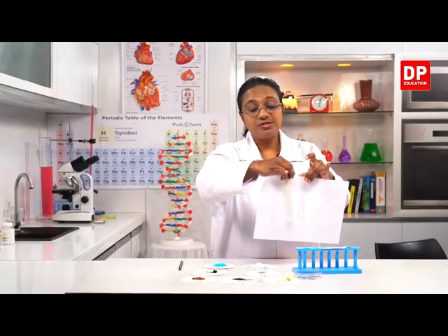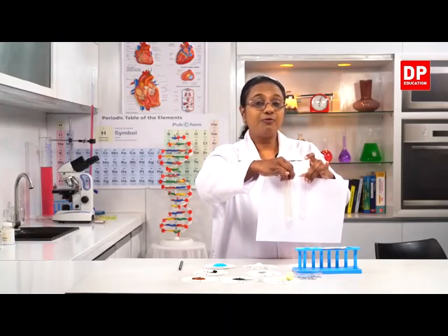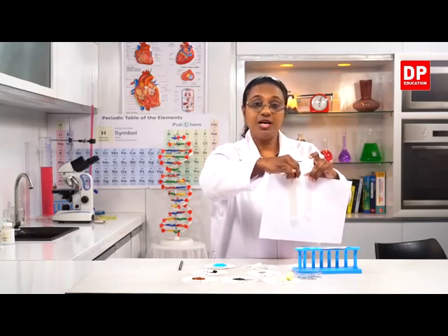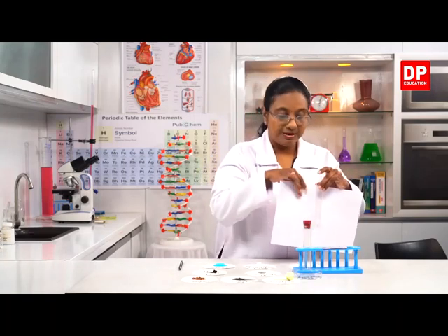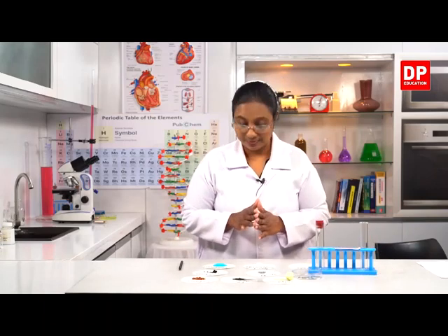Normally students, we don't prepare this in a very large amount because it's somewhat harmful to our health. Because of that only a small amount has been prepared, but I am sure you can observe the color there. So that is also an element. As you can see students, the elements can exist as either solids, liquid or a gas. So those are the elements, one type of pure substances.